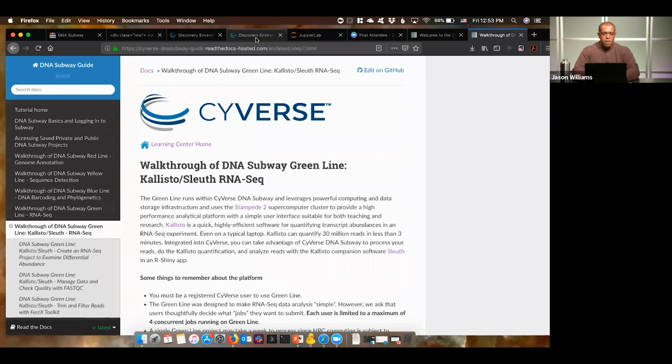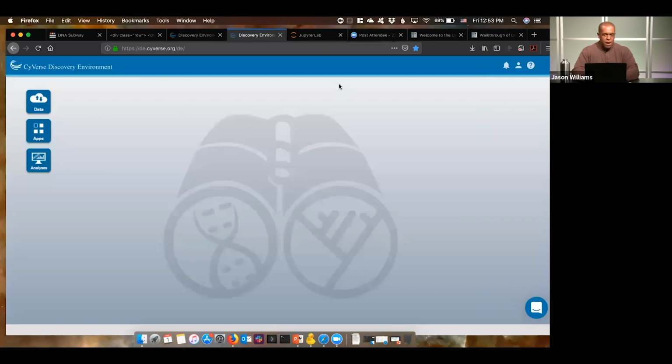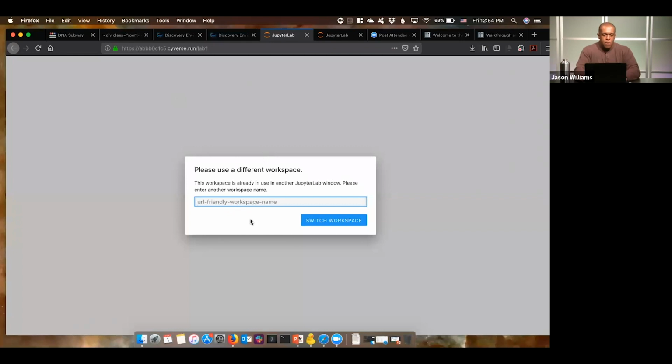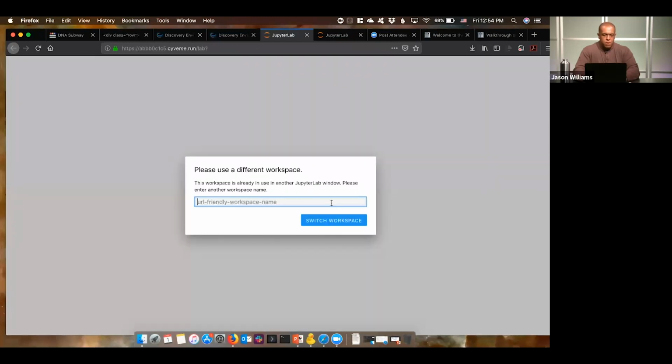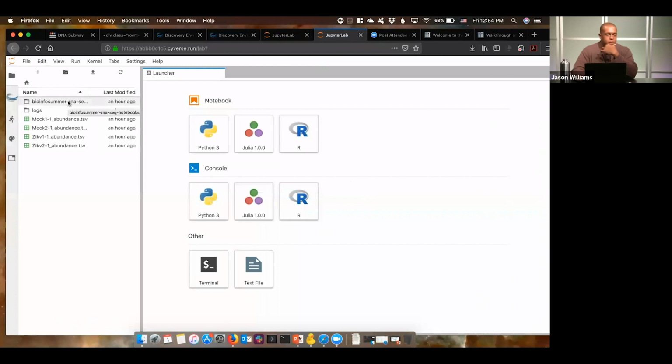I mentioned on the Discovery Environment, there's this new application called VICE. Just to give you in 60 seconds what you can do, I started a Jupyter Notebook. Let's go ahead and load that. Let's call it webinar, and see if that will load. Oh, I've got it open twice. I don't know if this will fix it, but one of them will work. Oh, I did have it loaded. Never mind.